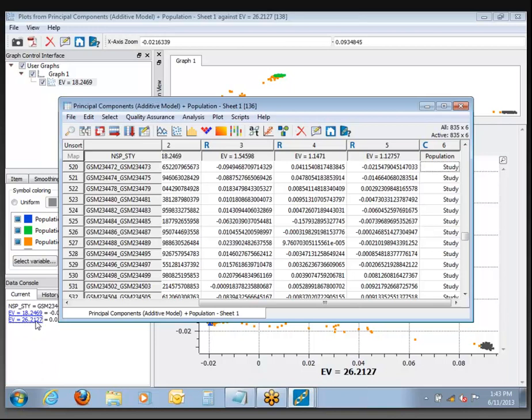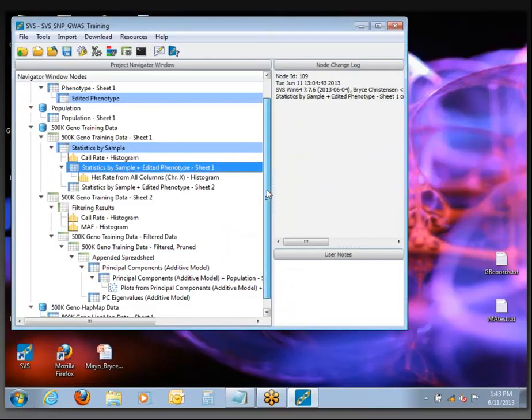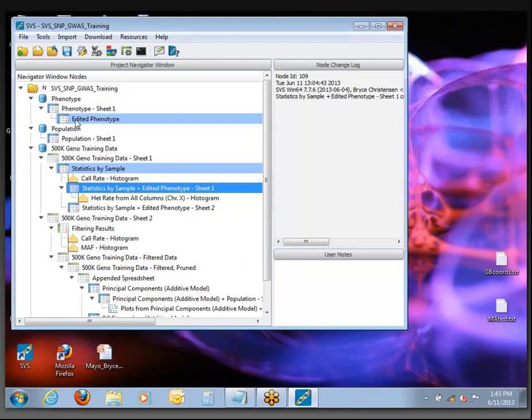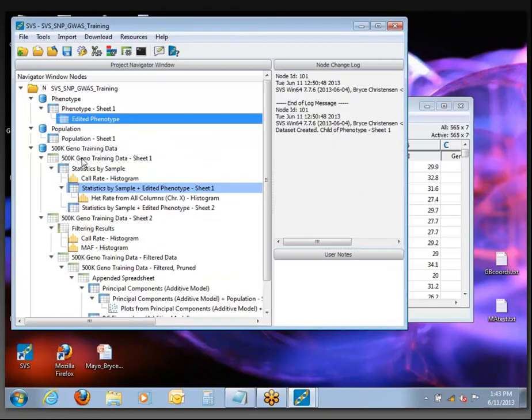Probably what we'll do is finish up Part 6 and Part 7, which is the basic association testing, then take a short break and move on to some of the sequencing stuff in the other project. So Part 6, SNP Quality Assurance. Before we get into this, let's clean up the desktop, close any of these spreadsheets we've been creating, and come back to our spreadsheet called Edited Phenotype that we made at the very beginning, then also open up our training data.